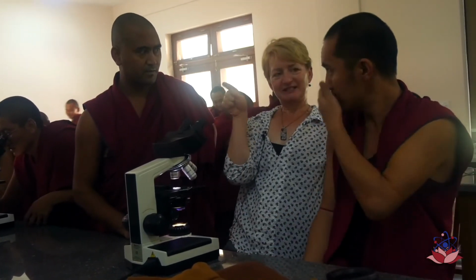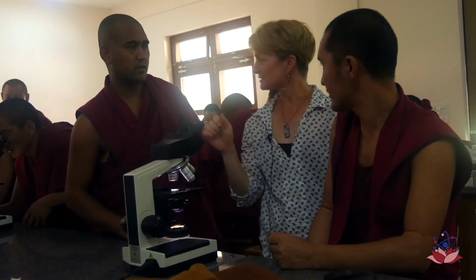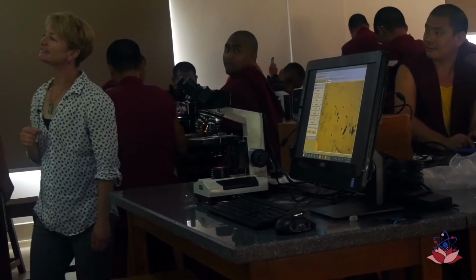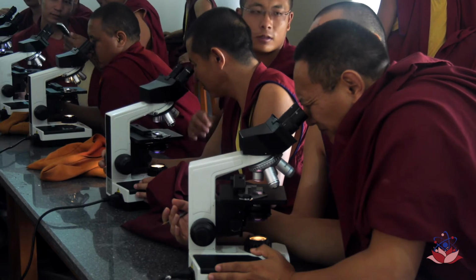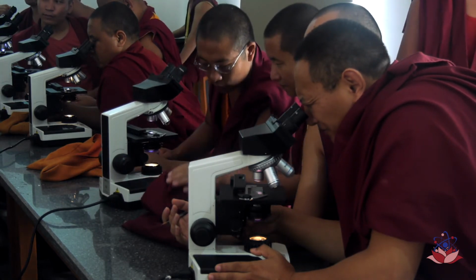If you look, you can see the cell walls, but there's no stain, so no nucleus. These are cells. So if you're done looking at the slide you created, you can come make the other type of slide.